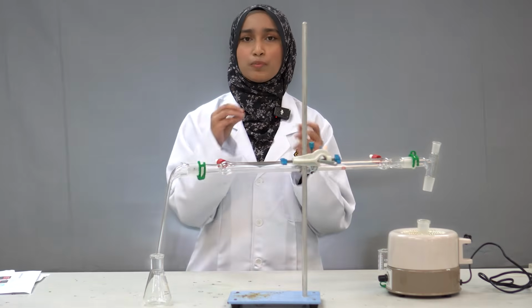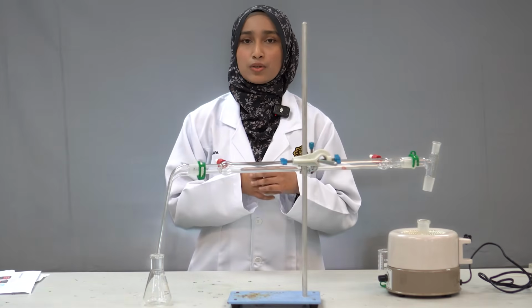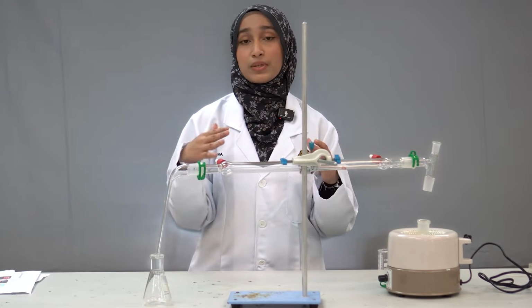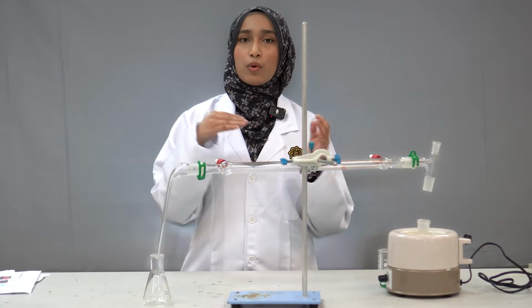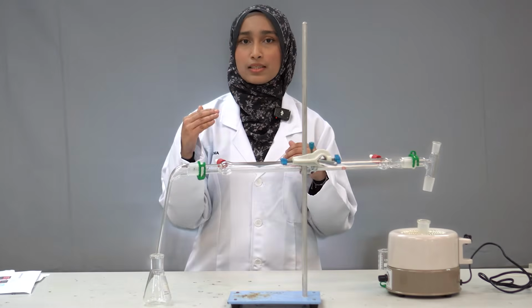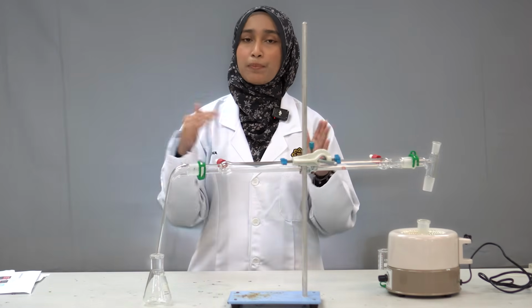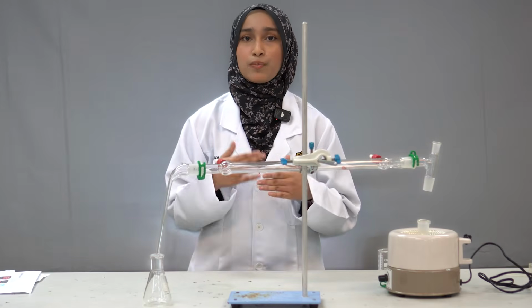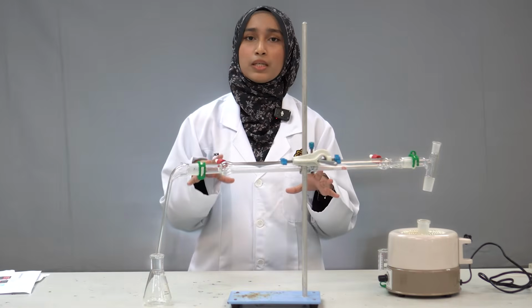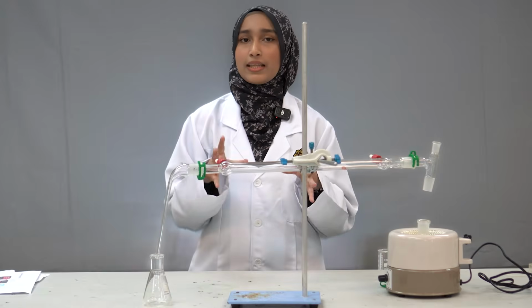This means that these impurities do not vaporize at the temperature where the water vaporizes. So this method uses simple distillation, which means that water will be heated and become vapor. When the water vaporizes, it will leave behind the non-volatile impurities, and when it passes through the condenser, it will condense back to liquid. So this condensed water is now free from most impurities and has a low electrical conductivity, indicating high purity of water.